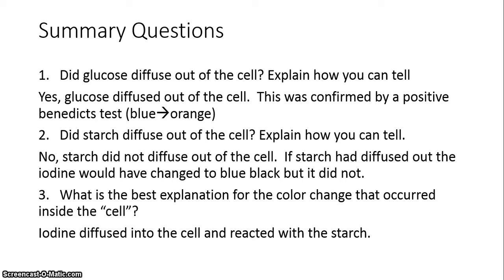So iodine's a small molecule as well, so it was able to fit through the pores. It went from where it was in a high concentration outside of the cell to where it was in lower concentration inside of the cell and reacted with the starch. So remember, all of these are examples of diffusion, molecules going from high to low.